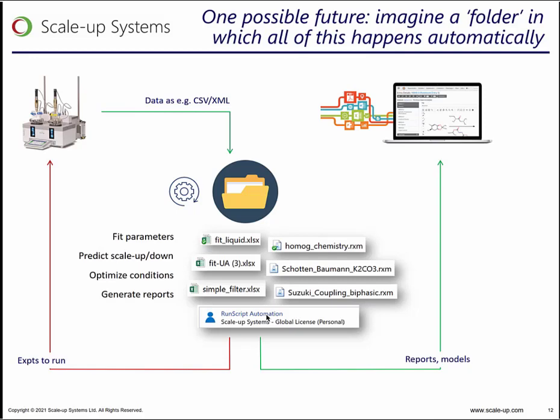Let's say that was a set of experiments on a reaction, maybe a liquid-liquid reaction, Schotten-Baumann maybe, and the data were pumped into the Schotten-Baumann Reaction Lab model. The parameters were fitted or refitted, no human involvement in any of that. And then the Schotten-Baumann model was opened in optimization to find out the next good experiment to do.